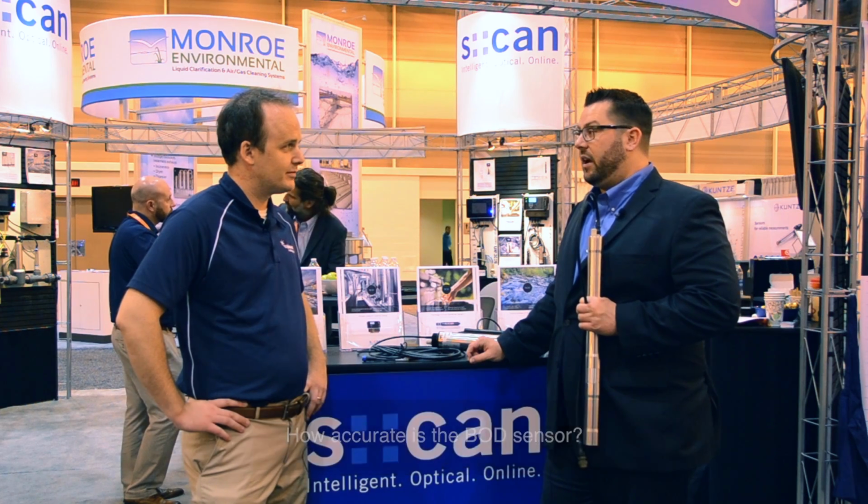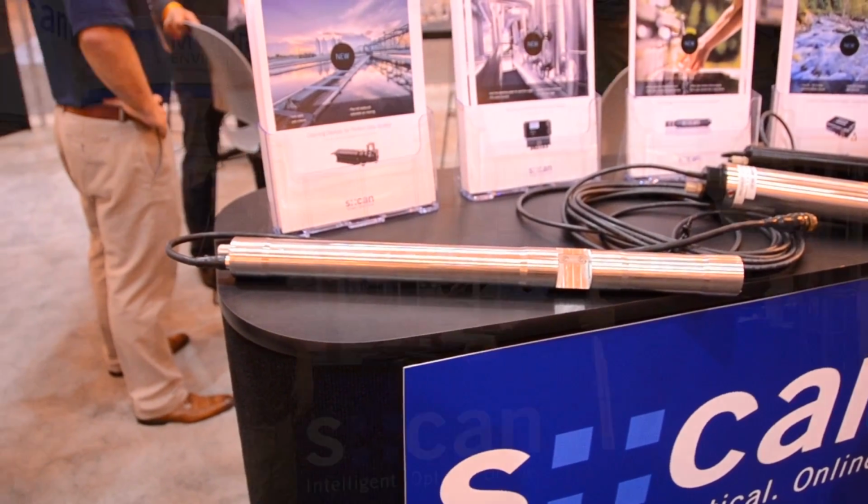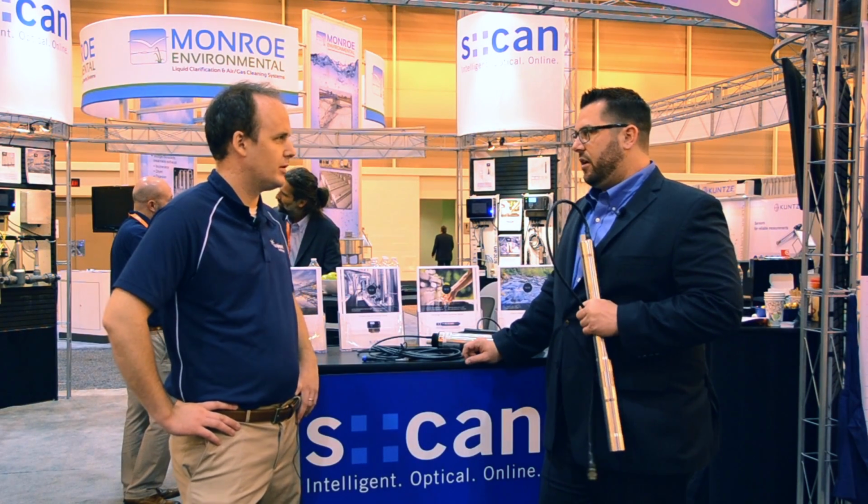So how accurate is that? BOD can be very accurate. It depends on your water quality matrix in most places, depending on your industrial influence, but we can be somewhere within plus or minus 5% of a lab value.